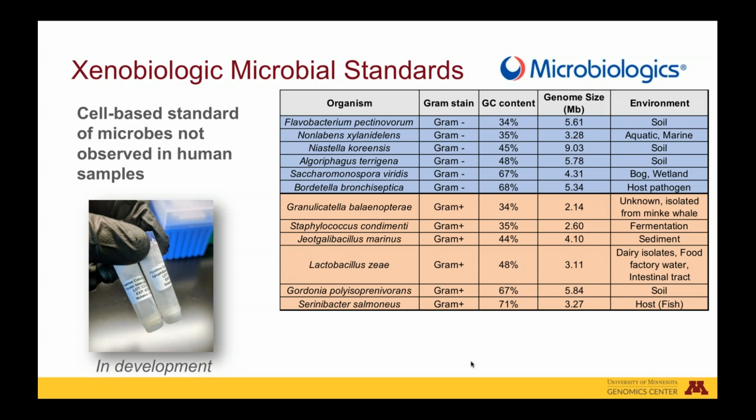So shotgun sequencing, even to shallow depth, can sometimes provide superior taxonomic resolution and even provide some functional information. But with either protocol, 16S or shotgun, having complete genome references specific to the members of our assemblage is going to allow us to unambiguously map reads from that shotgun data or have a high confidence in how to correct for the 16S copy number.